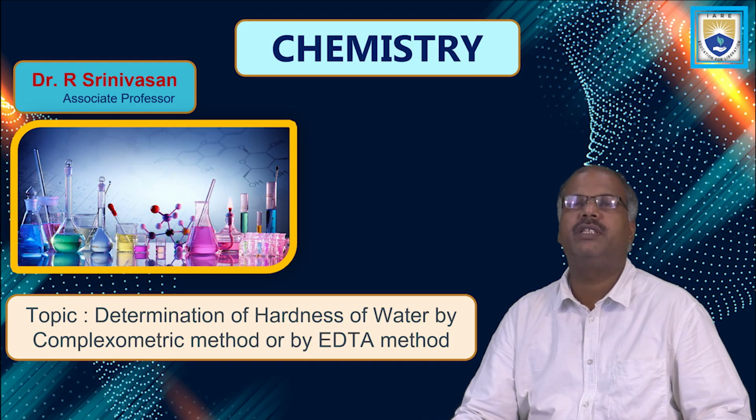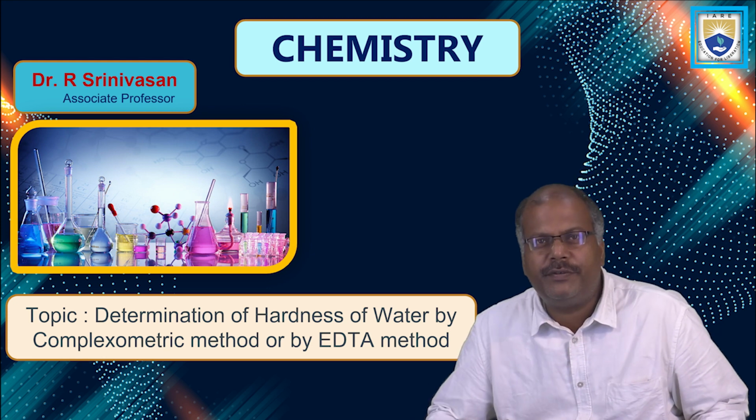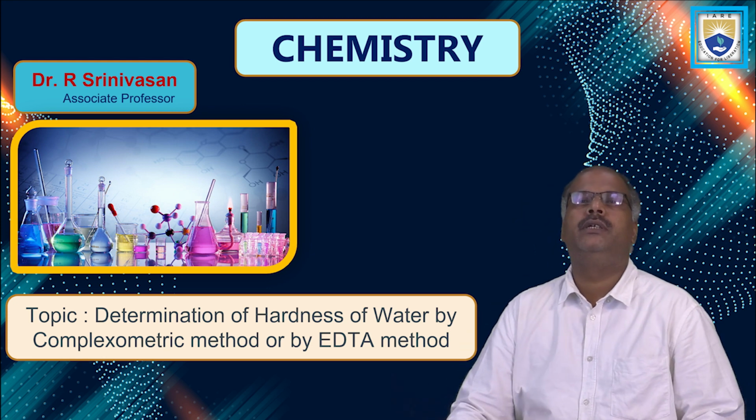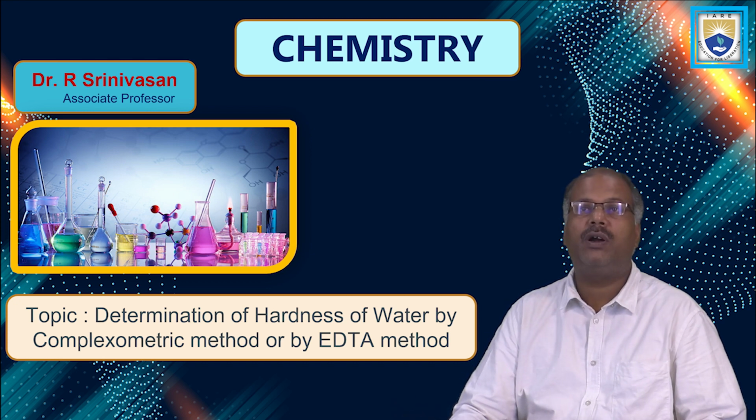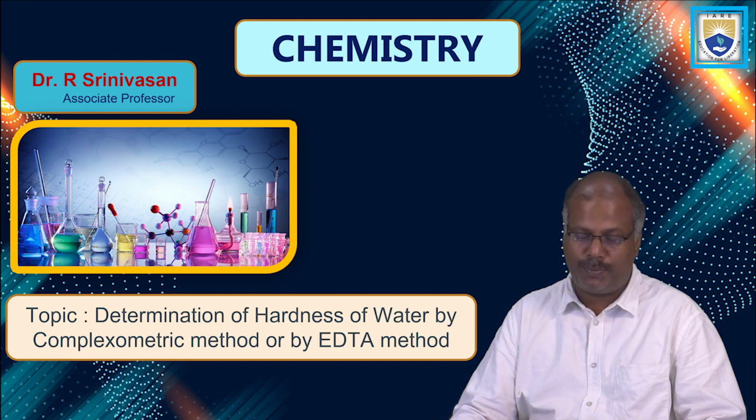Okay, today we will see the continuation of water technology. Today we are going to see determination of hardness of water by complexometric method or by EDTA method.